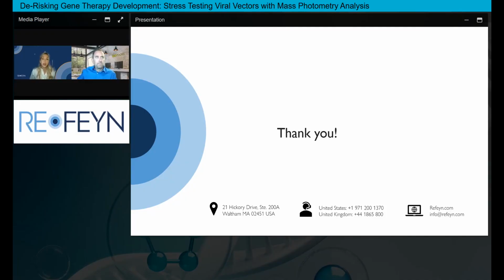That's a great question. So in the presentation, we only show one serotype. AAV serotypes are inherently different, and they usually exhibit different characteristics. Some researchers even say that thermal characteristic and stability are essentially the fingerprint of AAVs. Although it's not shown in this presentation, when different serotypes are exposed to the same temperature as the one that was shown in the presentation, AAV8, they don't behave similarly.